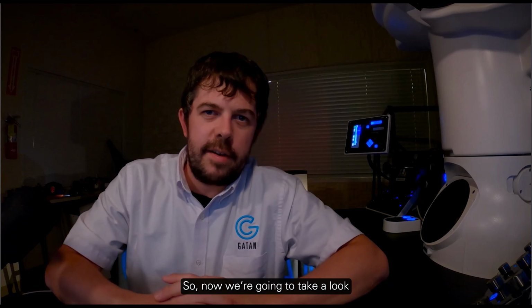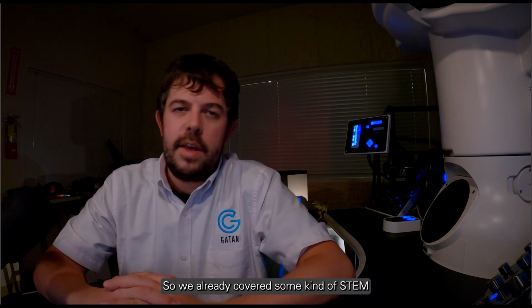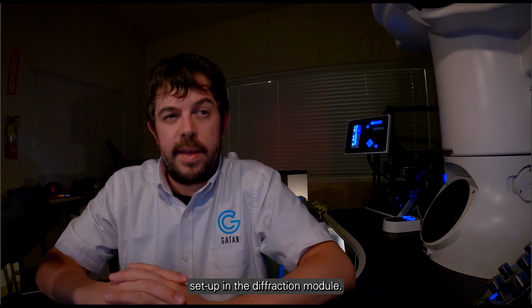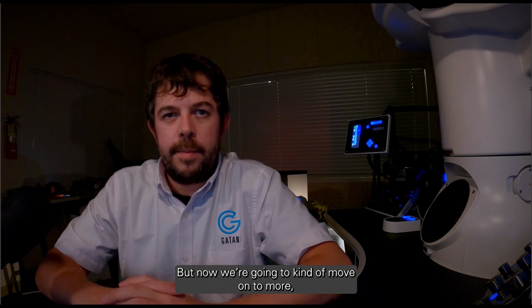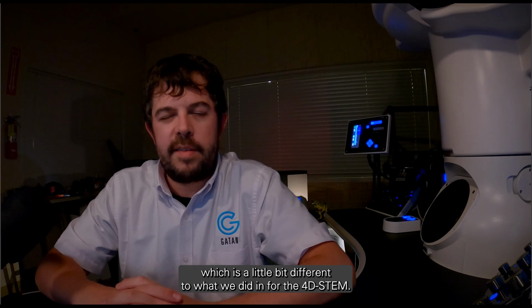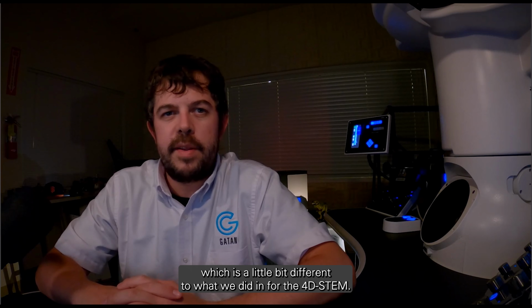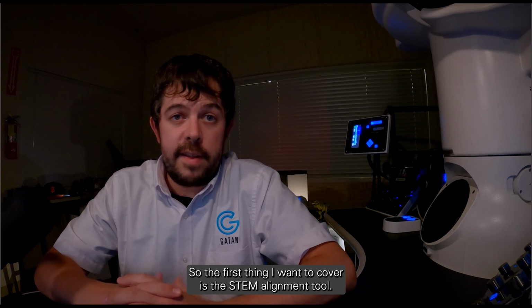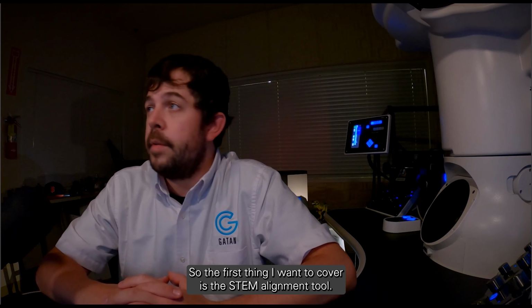So now we're going to take a look at another tool that's useful for STEM setup called the STEM alignment tool. We already covered some STEM setup in the diffraction module, but now we're going to move on to more EELS-centric setup, which is a little bit different to what we did in 4D STEM, but there's some overlap. So the first thing I want to cover is the STEM alignment tool.